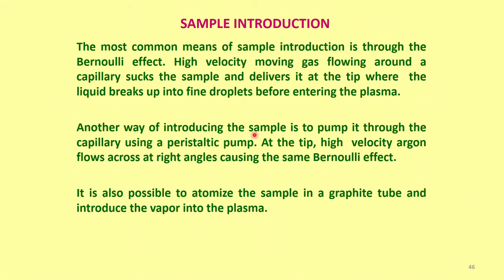The most common way of sample introduction is through the Bernoulli effect. So, what is the Bernoulli effect? It is a very simple system.